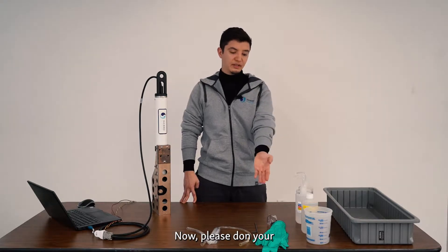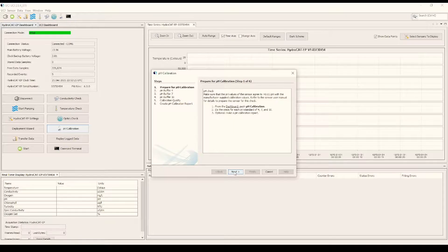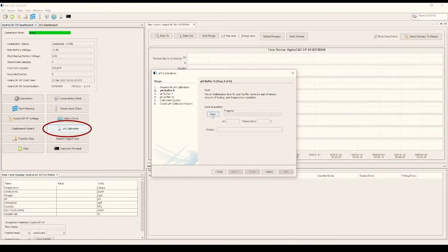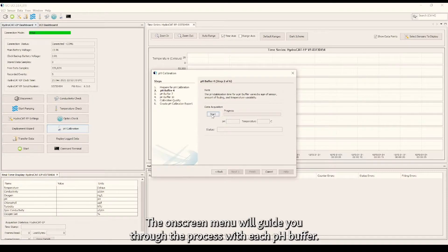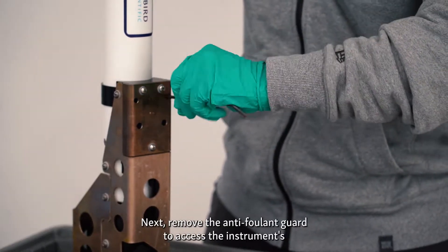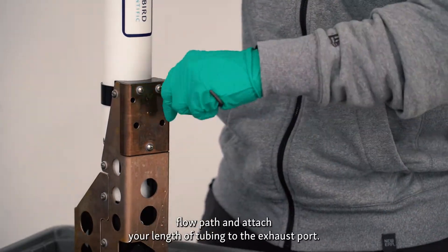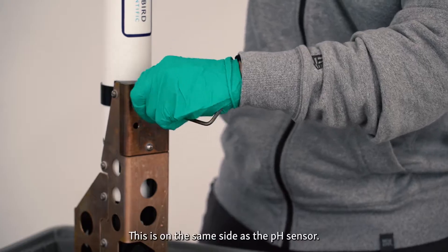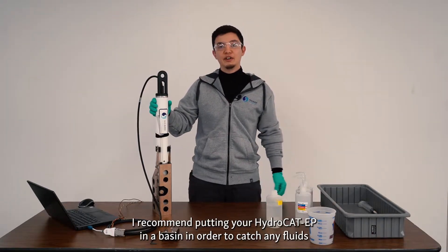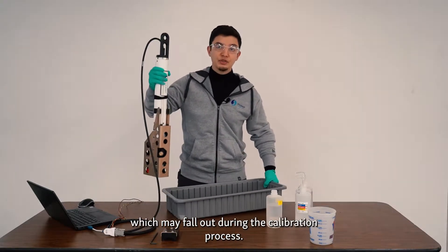Please don your safety equipment and connect your HydroCAD EP to UCI. Within UCI, start by clicking on the pH calibration button. The on-screen menu will guide you through the process with each pH buffer. Next, remove the anti-foulant guard to access the instrument's flow path and attach your length of tubing to the exhaust port. This is on the same side as the pH sensor. I recommend putting your HydroCAD EP in a basin in order to catch any fluids which may fall out during the calibration process.